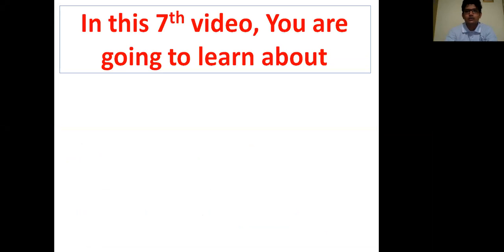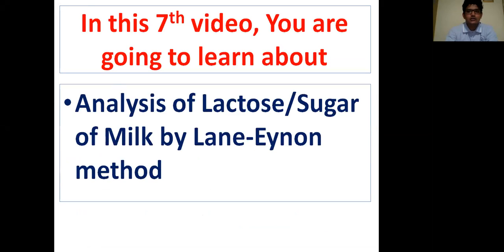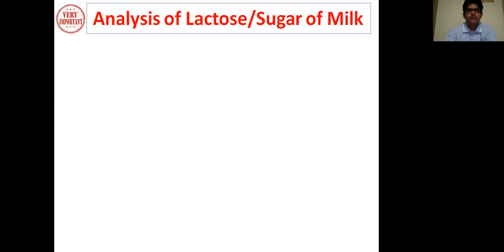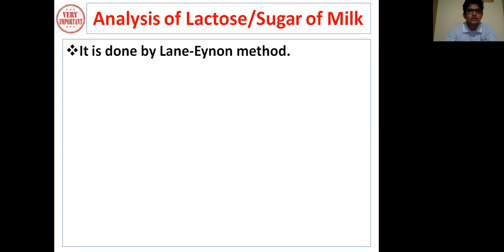In this 7th video, you are going to learn about analysis of lactose or sugar of milk by the Lane-Eynon method. In this video, we are going to see the analysis of lactose sugar present in the milk by using the Lane-Eynon method. Here we are going to discuss the detailed procedure for analysis of lactose or sugar present in the milk. It is done by the Lane-Eynon method.